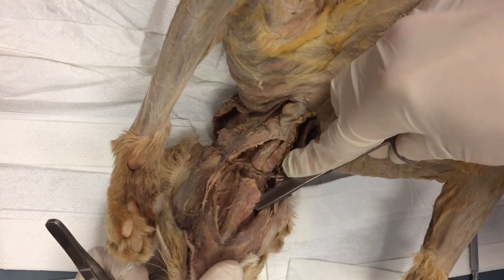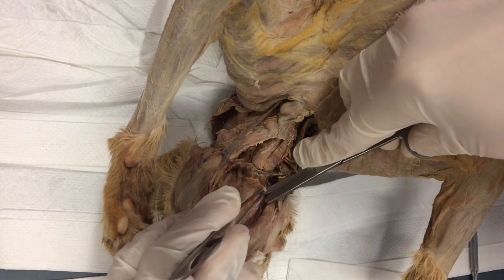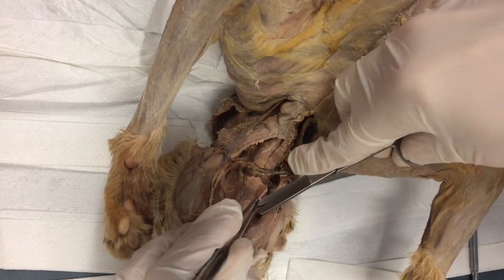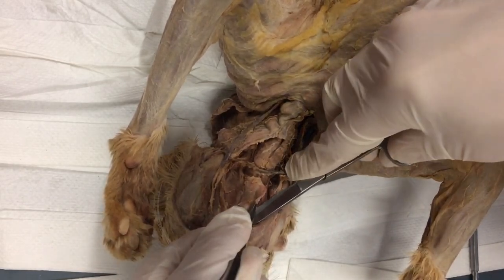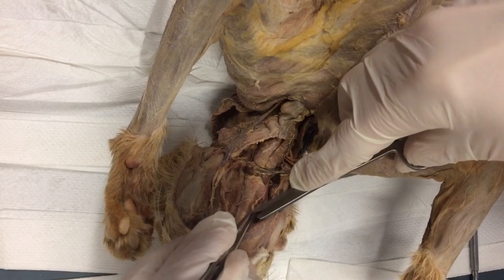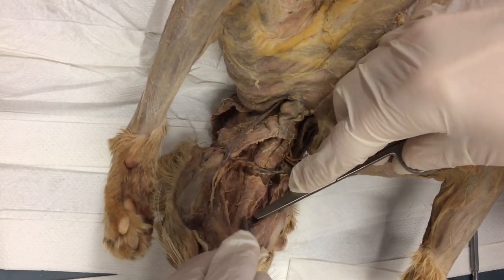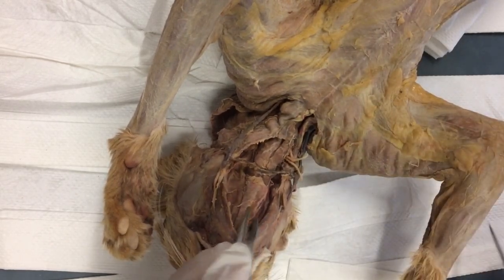So I'm just going to take my scissors, round side down, keep my fingers out of the way, little up support, baby nip, move, baby nip, move, and keep pressure coming towards you. That way you won't tear anything underneath. Baby nip, just keep doing this. Baby nip, baby nip. All right, now we'll finish the rest of the way here in a second.